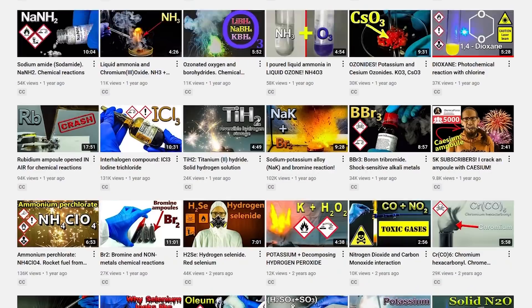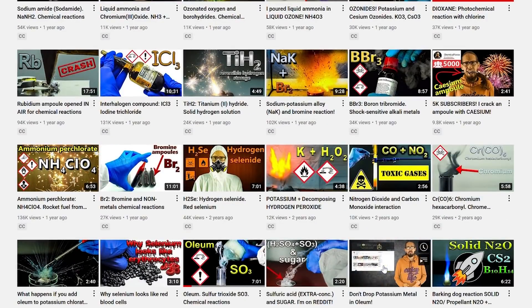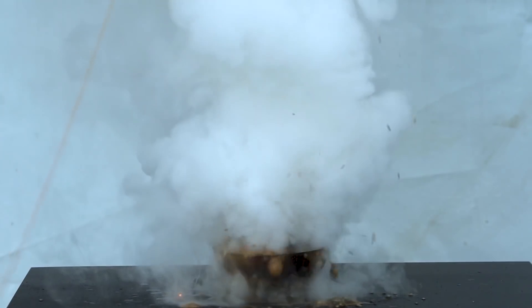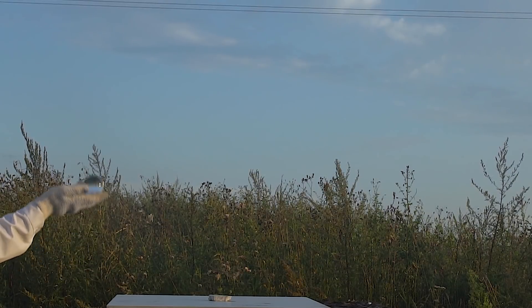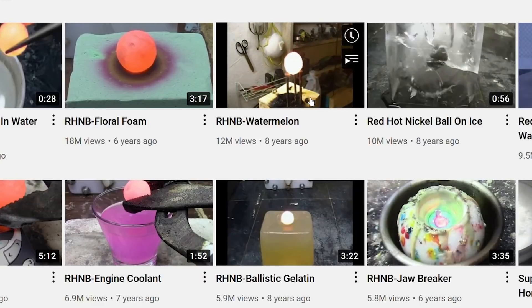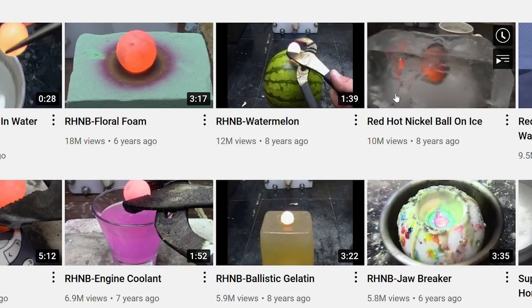Hey guys, I already have videos where I show what happens if you throw a piece of potassium in oleum or decomposing hydrogen peroxide. So in this funny and meaningless video, I'll try to melt potassium with an ice ball, like you all must have seen red hot nickel ball videos.